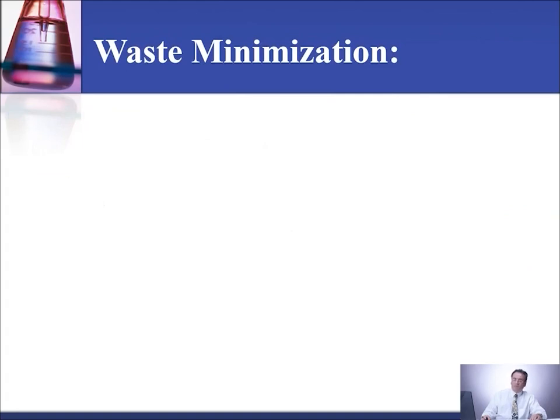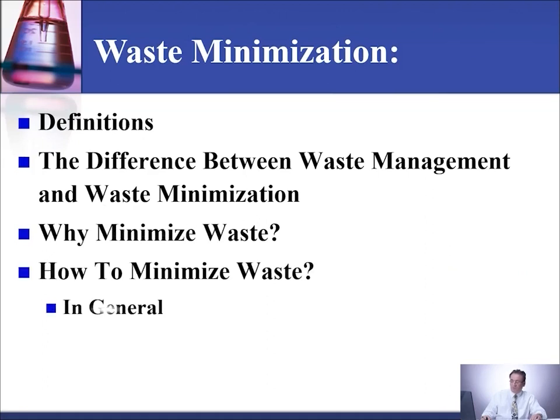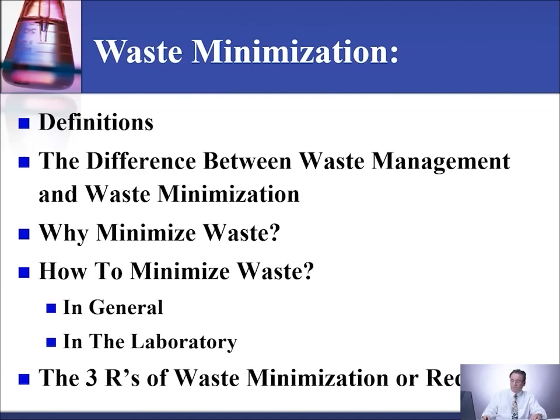Next, we're going to talk about waste minimization. Under waste minimization, we'll cover definitions, the difference between waste management and waste minimization, why minimize waste, how to minimize waste in general and in the laboratory, and the 3 R's of waste minimization or reduction.